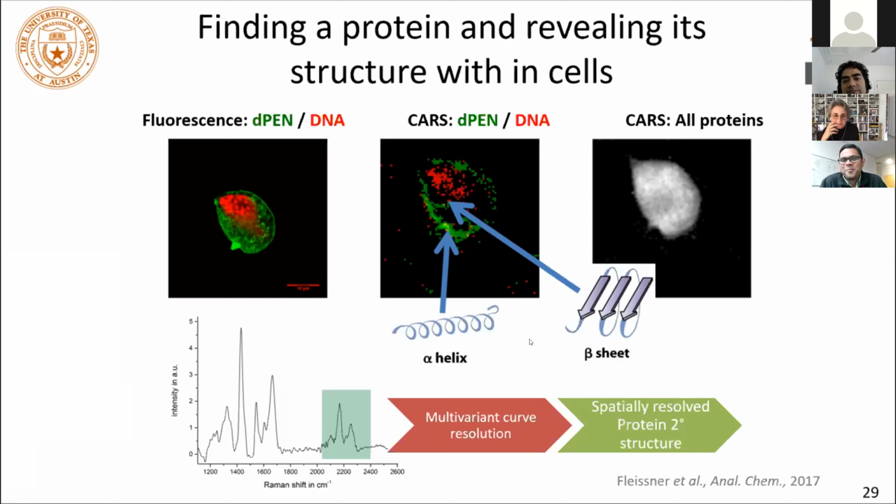I mean, the technique is fantastic, but one of the issues for us is we're working in 3D tissues, in organoids, which are in a bioprint. So they are very big. So do we have any hope of at some point being able to get that picture in the middle of an organoid?